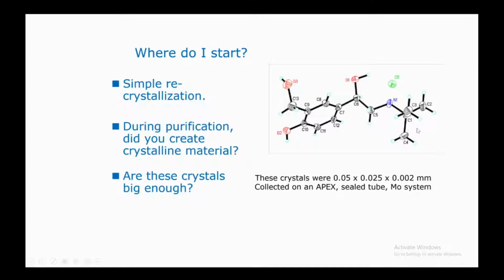It's super clear from a crystal structure what kind of compound it is, how many hydrogens, carbons and nitrogens it has, what functional groups it contains, what the connectivity is, and what the bond lengths, bond orders and bond strengths are. So many things you can tell from a crystal structure, and moreover it's beautiful to the eye and clear to the mind. That's how I define crystals.